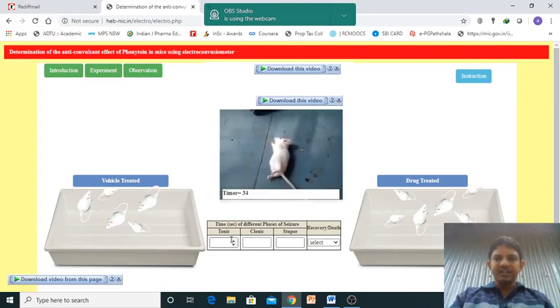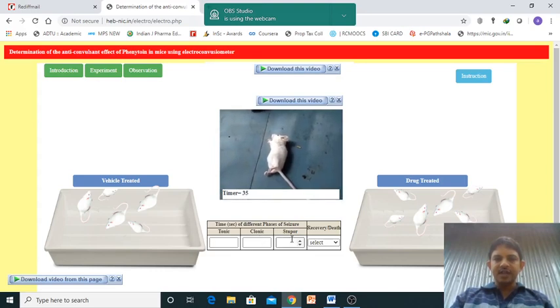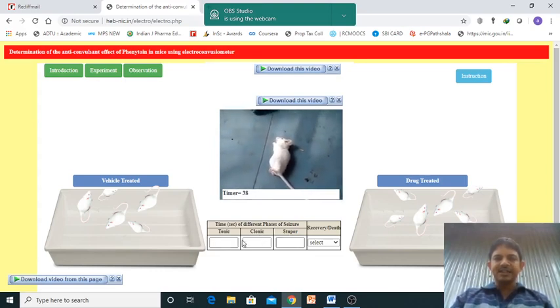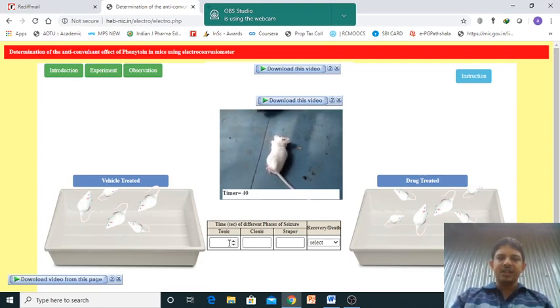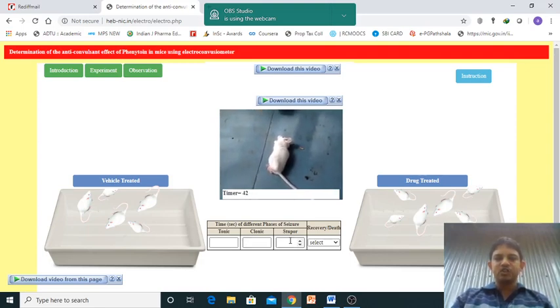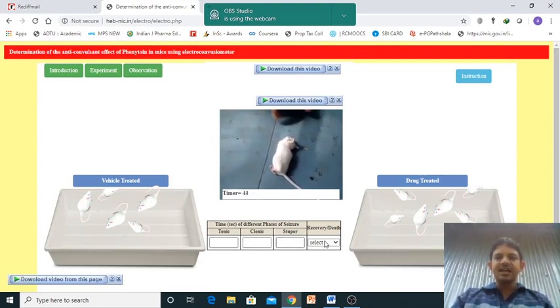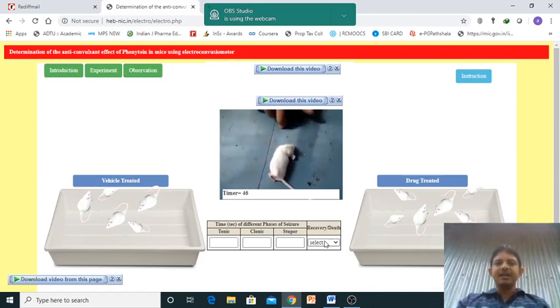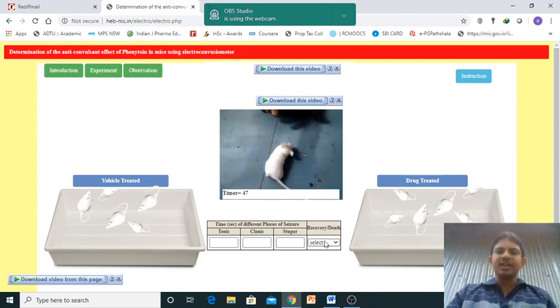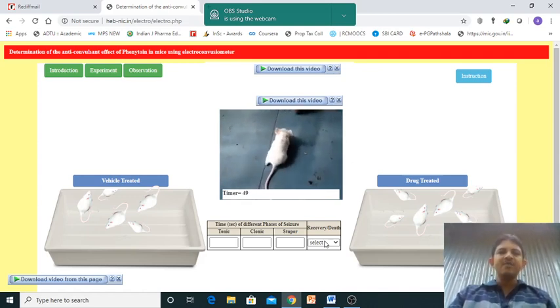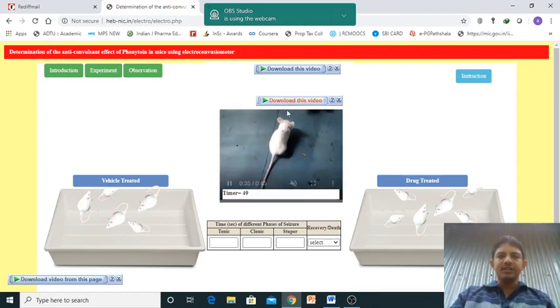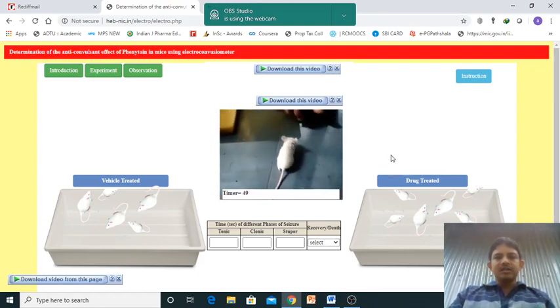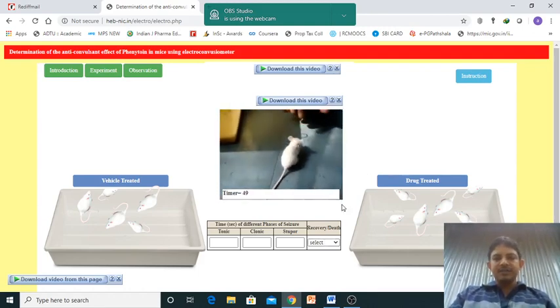Three things we need to mention here - the time in seconds spent in the tonic phase, in the clonic phase, and the stupor phase. And here, either the recovery or the death of the animal after giving the electric shock. So the recovery is there.